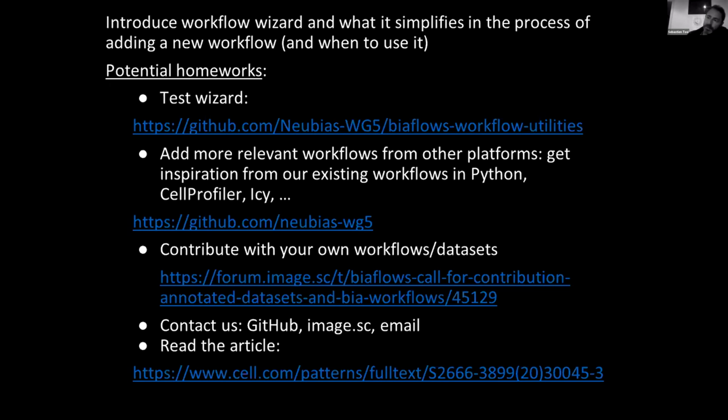You can also add images if there is no images dataset that would correspond to your problems. And I also invite you to actually contribute datasets, especially if they are annotated. That's quite interesting for us. So there is a thread in the BIAFLOWS forum where you can say, look, this dataset, I think it could be interesting to have it there. Then we would add it on the main instance. And if you have some workflows that are running on these images, then we would also add them if you wish to make them available to the whole community.